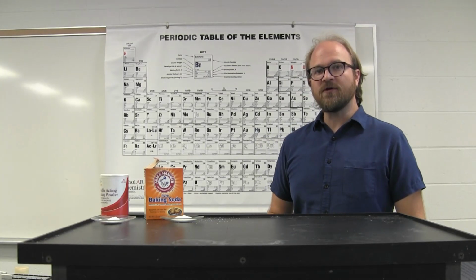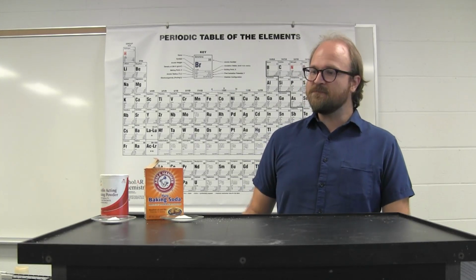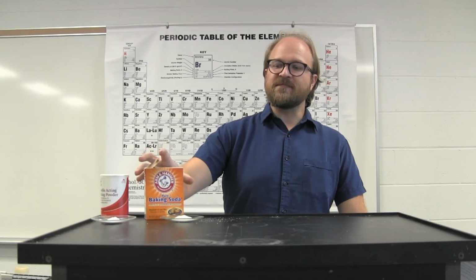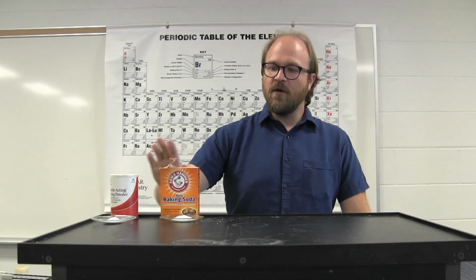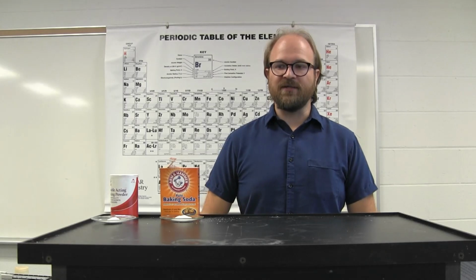This experiment looks at the percent composition of different carbonate compounds. In the first part of the experiment, you're particularly looking at the percent composition of baking soda and baking powder. Baking soda is a pure compound, sodium bicarbonate. Baking powder is a blend of a number of different compounds, one of which is baking soda.